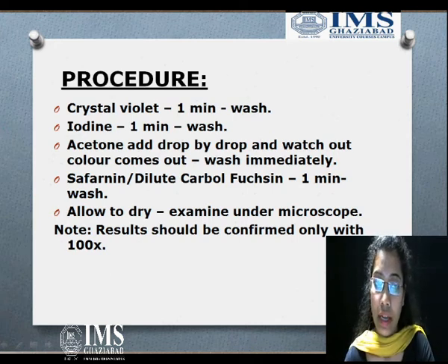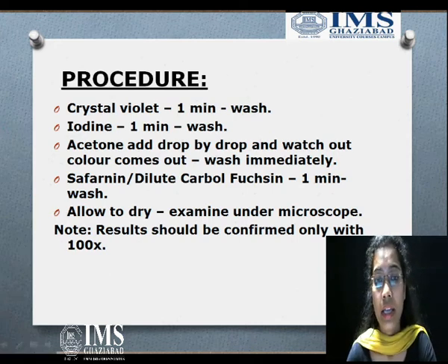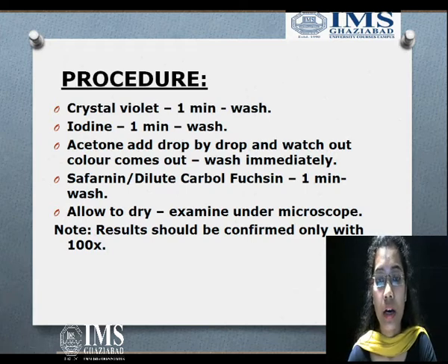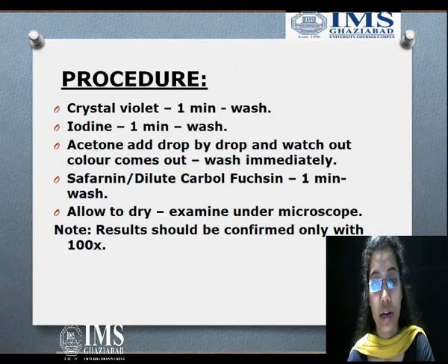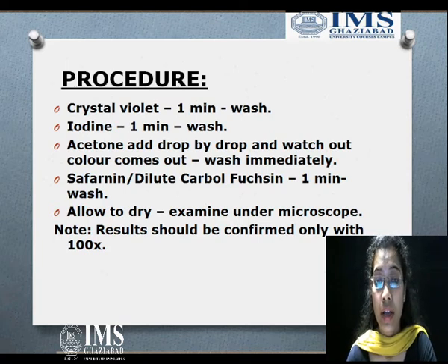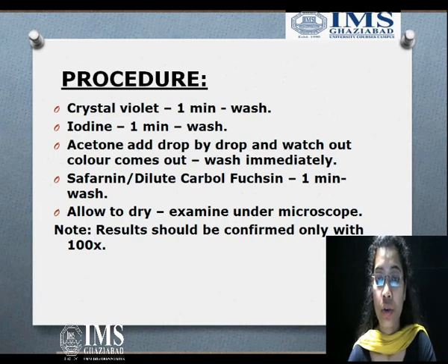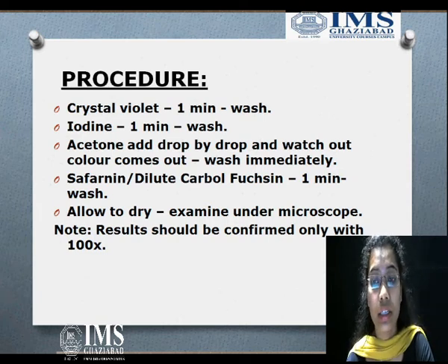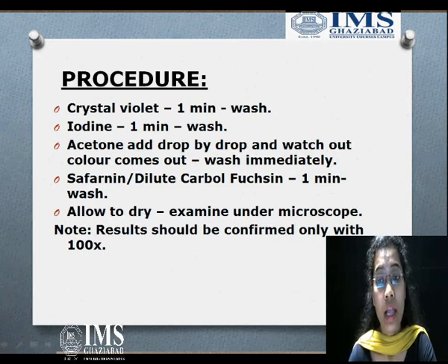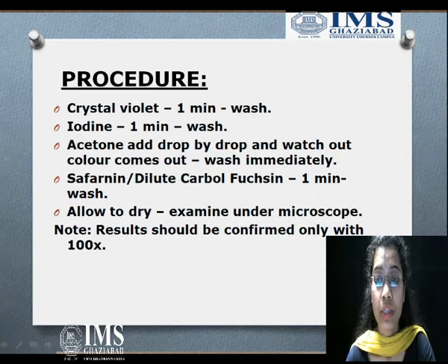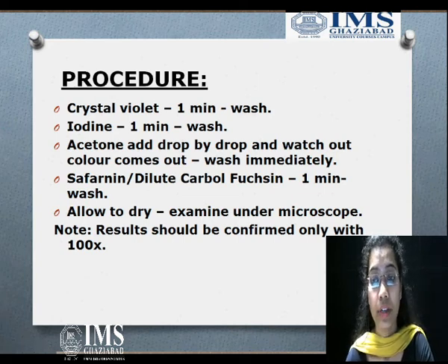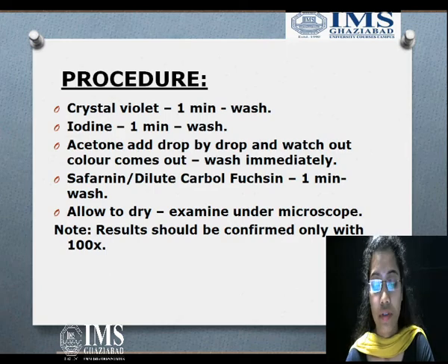We wash the slide again and then allow it to dry under air only — not heat fixed — only air dry. After air drying the slide, we use oil immersion to study the slide under the microscope. Note that if you are studying the slide with oil immersion, you have to use 100x magnification power.